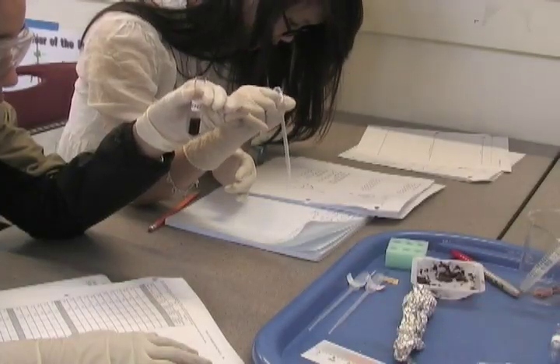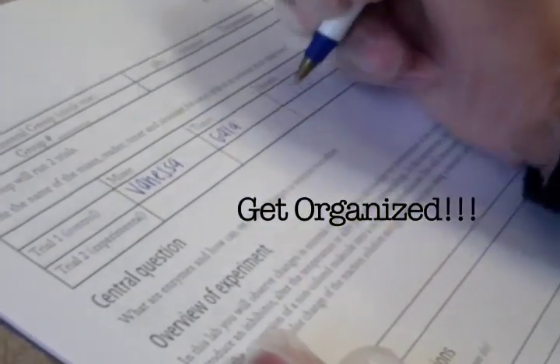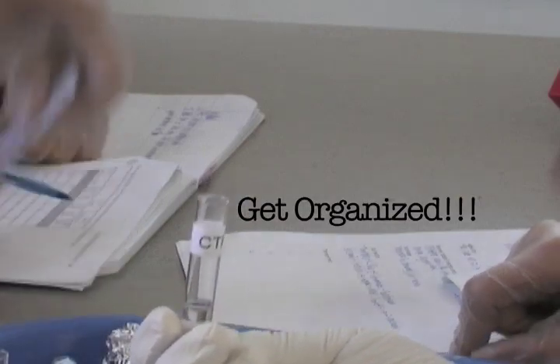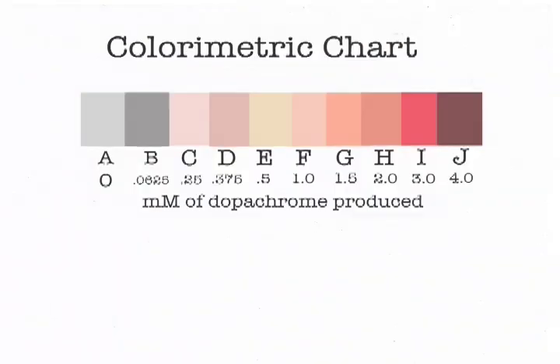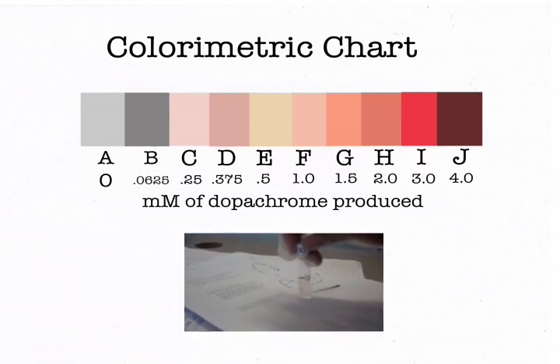Now, make sure that everyone in your group is ready to jump in. Make sure that your roles are assigned before you start the process. The reaction you will do next is going to move very fast and will start right away. You won't have time to get organized at that point. Be ready with your data chart, timer, and colorimetric chart. If you're wondering what that is, it's a chart that measures the amount of product, in this case pigment, being produced by the tyrosinase and L-DOPA reaction.